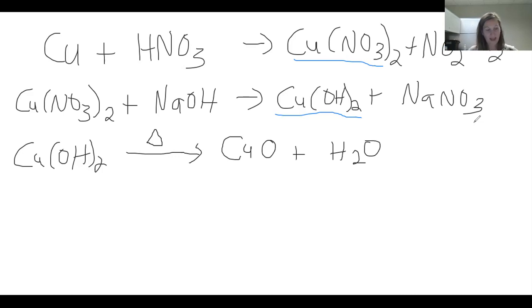All right, so that is the first pre-lab, the first 3 reactions for lab 10. We then isolate in that third reaction this copper 2 oxide, which I believe is a black solid, and we use it the next week for the following 2 reactions. So on page 61, it says during week 2 of the procedure, we're performing 2 more.